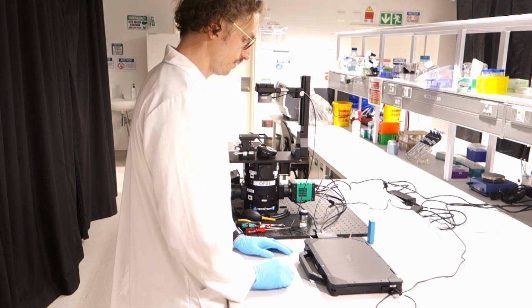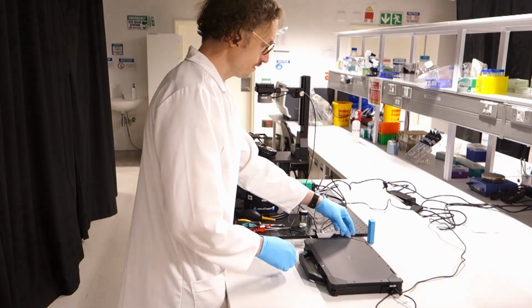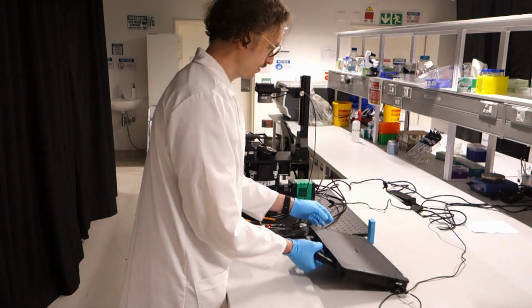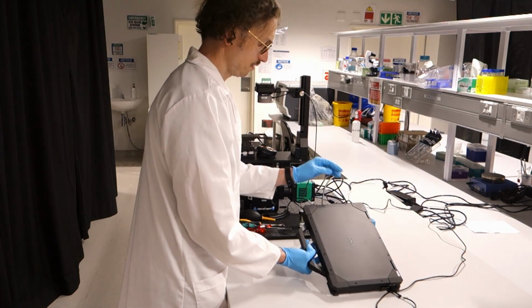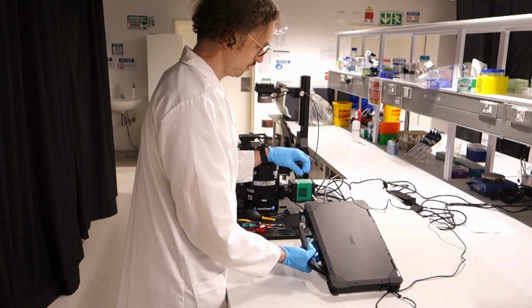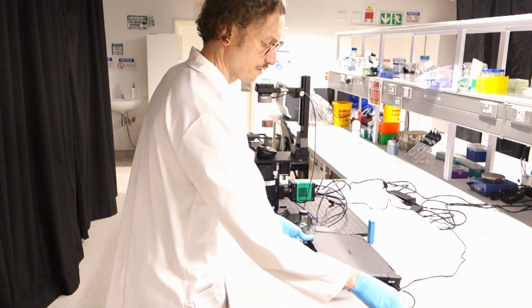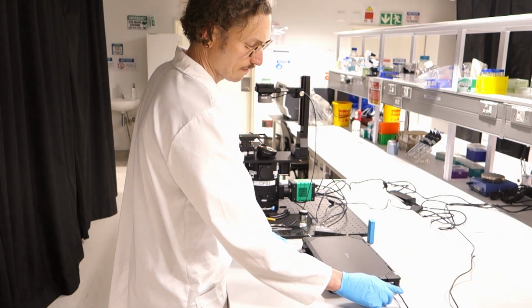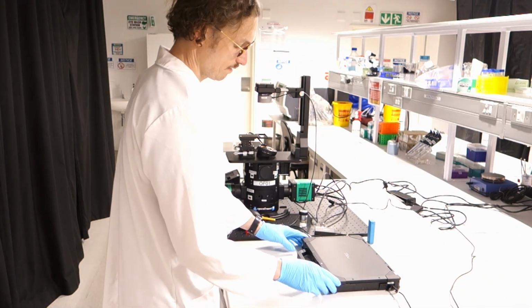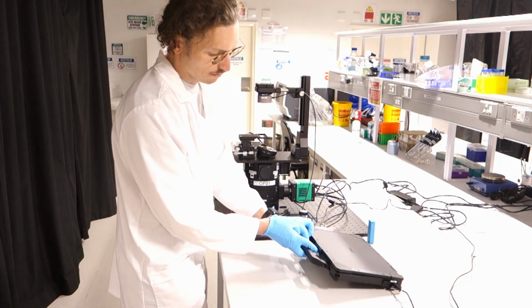First, ensure that all applicable USB connectors from the openScope Traveller are connected to the laptop. Confirm that OF17 is indeed connected to laptop port P01, and that OF18 is indeed connected to laptop port P02. Connect the laptop to its power supply and log in using the credentials supplied in your manual.